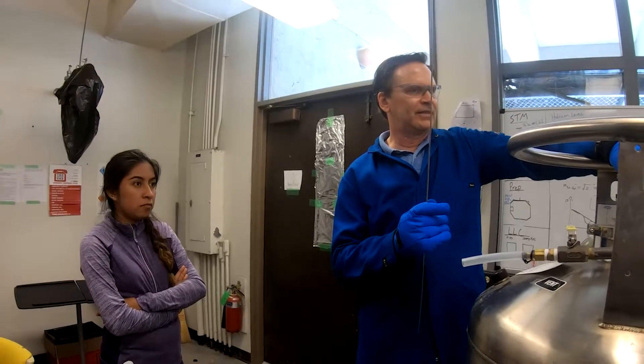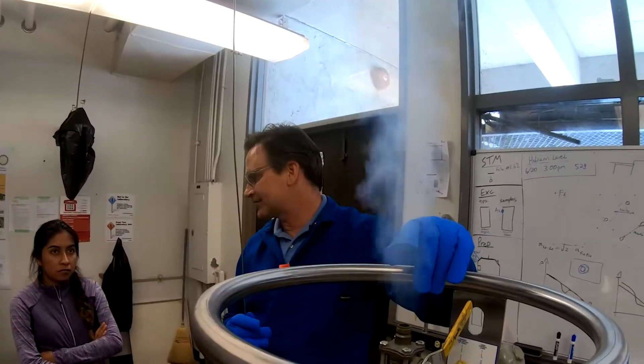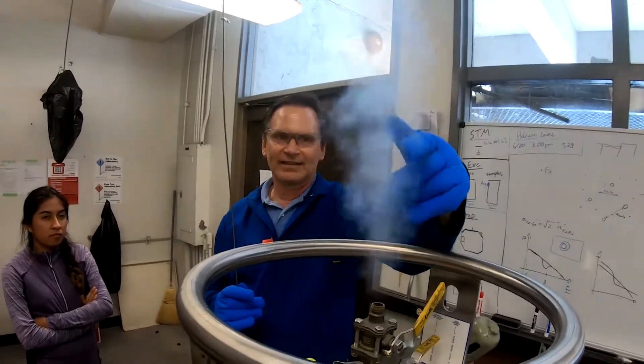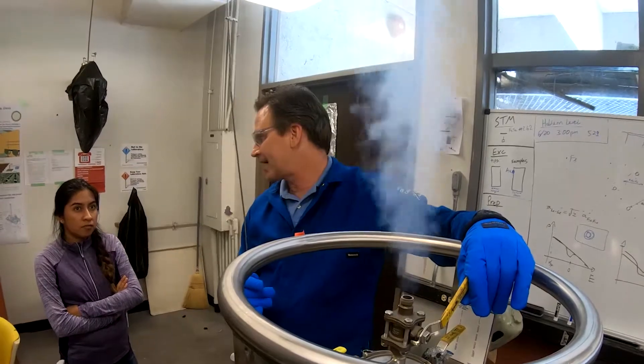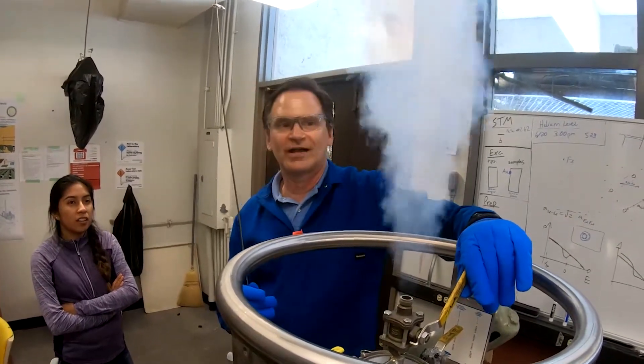We're going to slowly open up the top of the dewar. So cold, the gas is so cold, helium is an invisible gas. We're getting this white plume here because it's making water vapor freeze out of the atmosphere. And that's why it's visible.